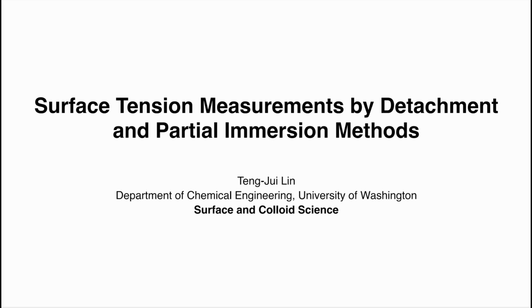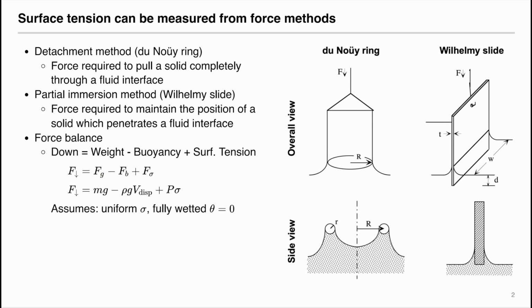Welcome back. In this video, I will talk about the measurement of surface tension using force methods, such as the detachment method or partial immersion method.